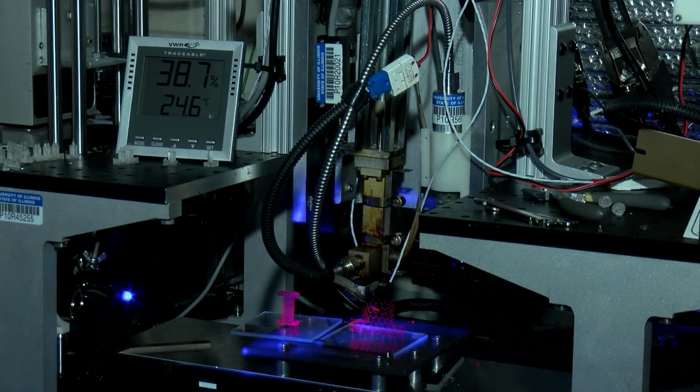If we can actually replicate a tumor consistently, then we would have a good kind of model or standard system in order to test other technologies on. It's a new spin on 3D printing.